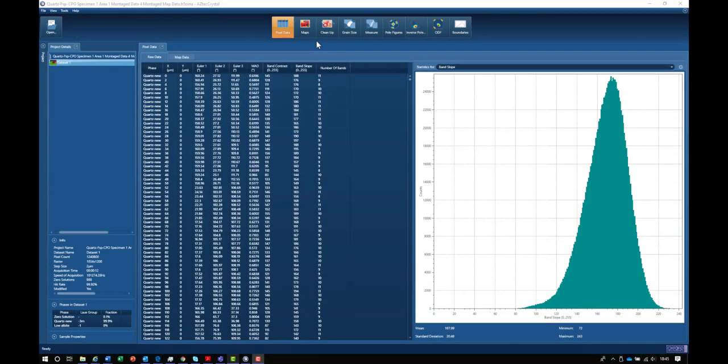I'm looking at our Aztec Crystal software, which is our new software for processing EBSD data, and I'm looking at a dataset from a quartz rock sample.